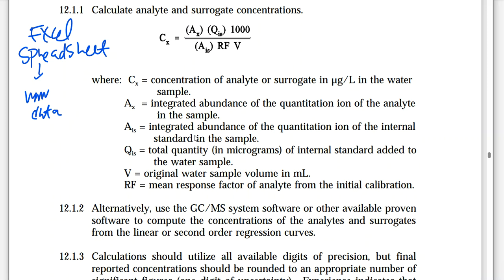Those calculations are embedded because they want to make sure that things like this are taken care of the proper way. And they don't want you to make mistakes. They don't want you to put values into a calculator, key them in the wrong way, and provide wrong data. So they're going to build these templates, and you're going to be keying your raw data most of the time into these spreadsheets and allow the spreadsheet to do all the math work for you. It makes it very simple, makes it very easy.